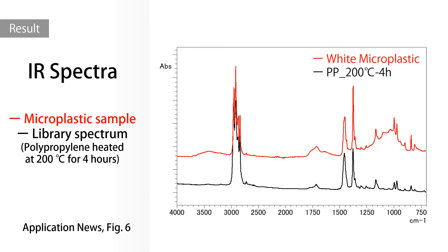The red line is the sample spectrum while the black line is the library spectrum. The library hit indicated the microplastic spectrum matches that of degraded polypropylene. The characteristic hydroxy and carbonyl peaks are also detected, indicating the plastic in question has gone through environmental degradation. The simple measurement identified the white microplastic to be that of degraded polypropylene.